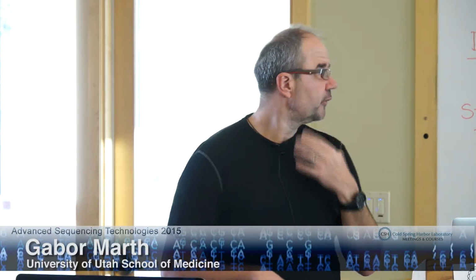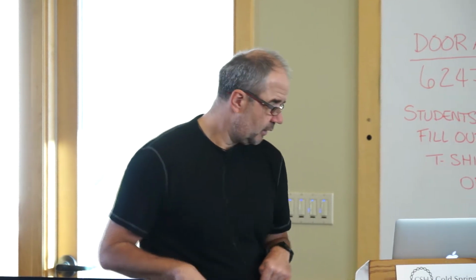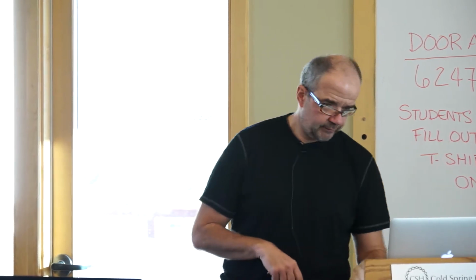What is more commonly and more successfully done is assemble reads from a particular region, including unmapped reads and unmapped mates, etc., and try to reconstruct the sequence of this individual in this region, and then compare that to the reference or some other individual. Okay? And it turns out that there's another method that I'm going to be talking about later, and that's also completely reference-free, and that's the method that Andrew developed.